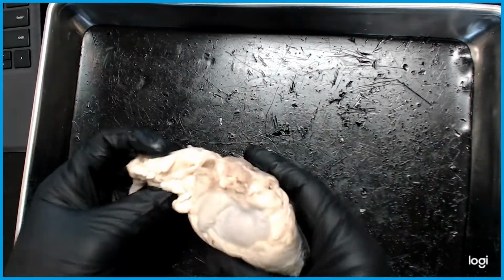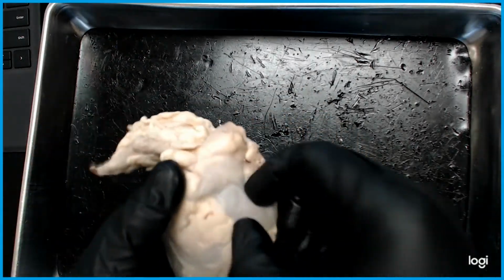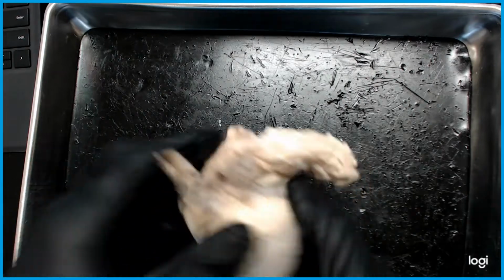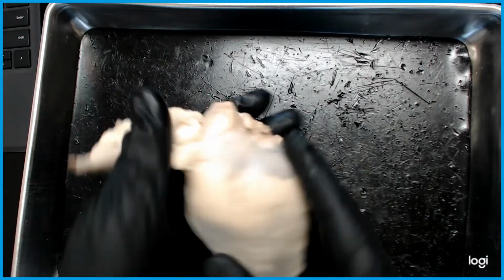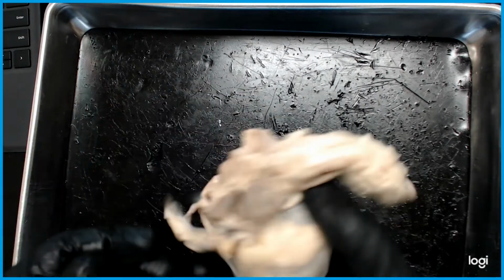Heart. This is what we're going to use today. We have a sheep heart. The outside is a pericardium, and we must hold it to determine what's going to be anterior or posterior. So before we get into that, let's go ahead and take off the pericardium.